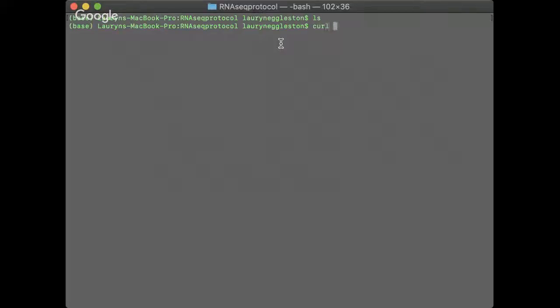The first thing that you would want to do is get the X chromosome data for this assignment.